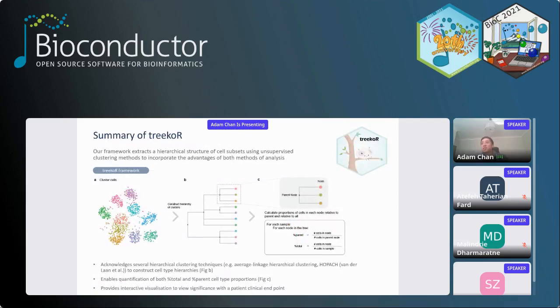Now, we present TREEKOR here, and TREEKOR aims to incorporate the advantages of both methods by offering to cluster the cells and then deduce a hierarchy of cell types, and this enables the measurement of cells relative to a parent and also cells relative to all cells in the sample. And this is something that analysts have done as well with either manual gating or attempted to do using unsupervised clustering methods as well. But TREEKOR makes it easy to extract and quantify these cell type proportions.